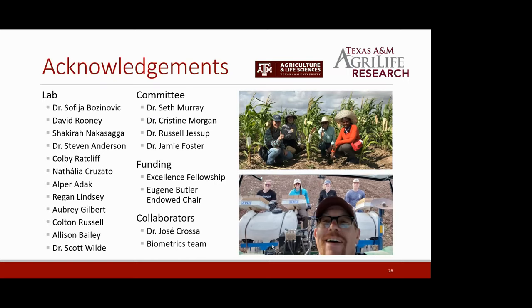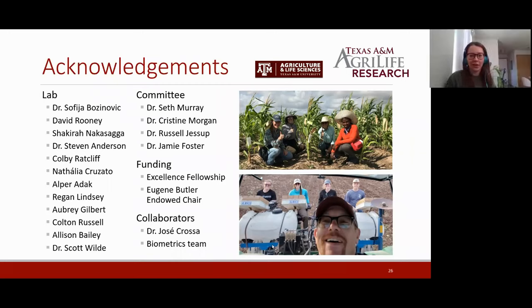I'm going to skip to the next question from Lee DeHaan. Did the NIR data make a relationship matrix that was well correlated with the genomic relationship matrix? Yeah, that's a great question. If there's anyone who is interested in taking a deep dive into the genetic data from the study, that is publicly available. It is not something that we looked at, but I think it would be really interesting to have that direct comparison between a genomic selection model being performed on this data and then compare it to the phenomic selection.